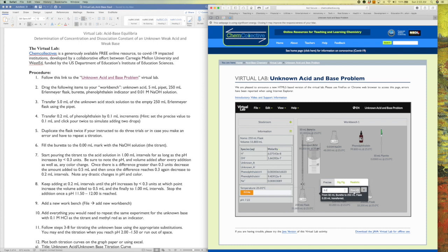And so I now added another 0.2, so it's going up, right? And it's going up by 0.3, but it's okay. We're going to stay with increments of 0.2 ml. Wow, that was a big jump. Did you see? But that's okay. That is why we were using such small increments of volume, right? Because we wanted to make sure that the jumps that we get are not going to be that large.